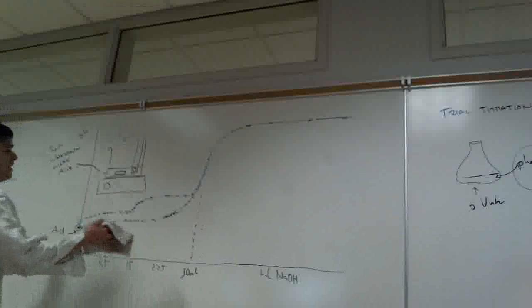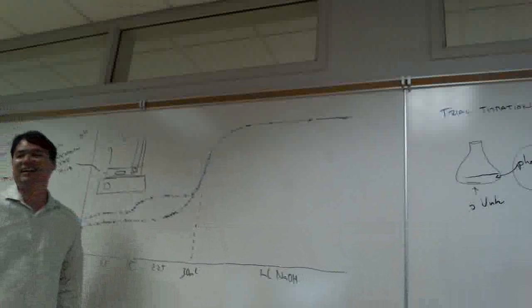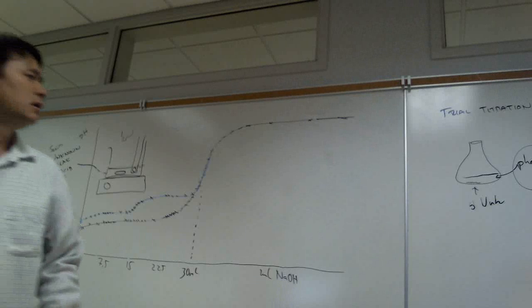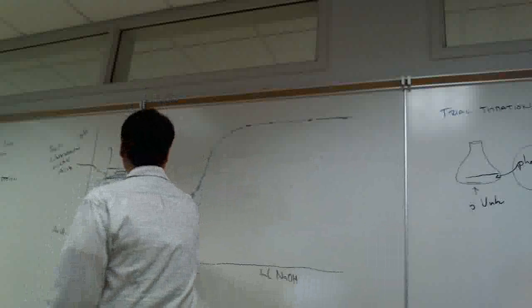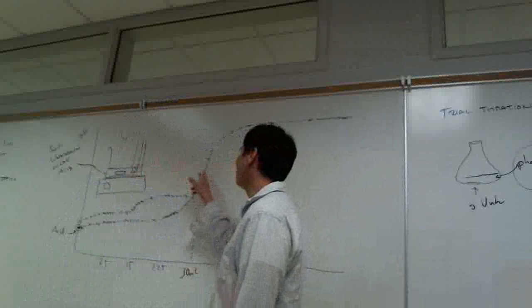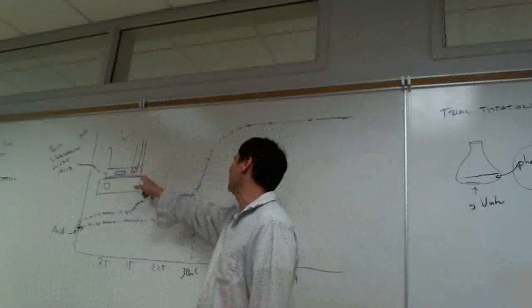All right, this lab, you're going to write a formal scientific lab report, explaining how you determine what your unknown acid is. You're going to have the pKa's, you're going to have the stoichiometry, that is, we can calculate the molar mass, we have the grams of unknown.